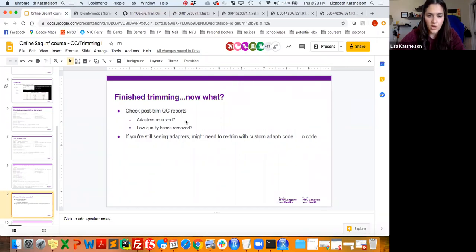For the Python module, I think Tosh addressed that. It really depends on what your HPC has. I know this particular module works with Cutadapt, but I think Python 3 should be fine.